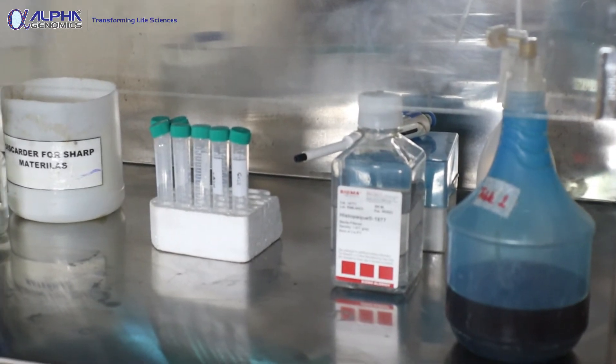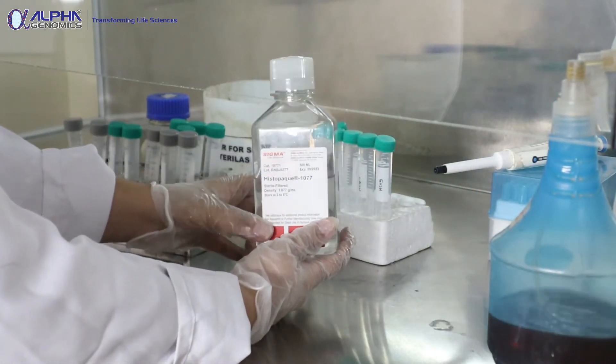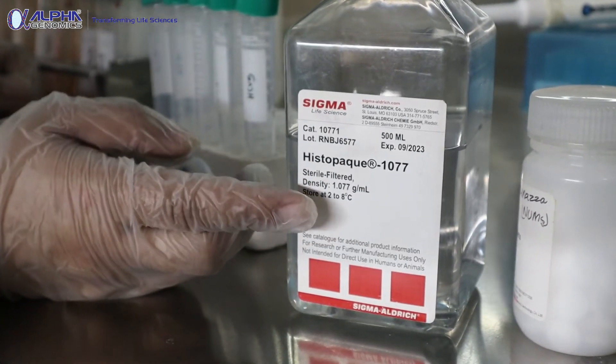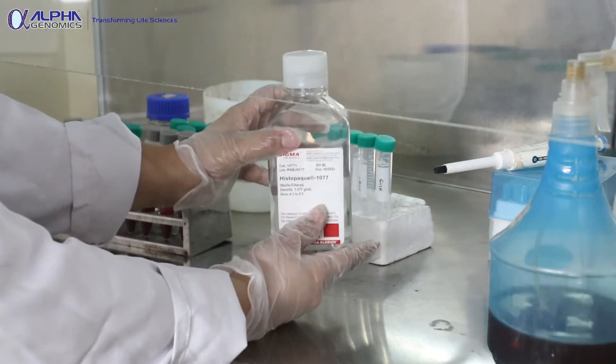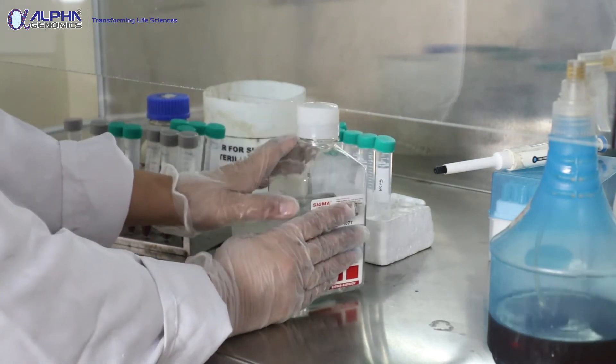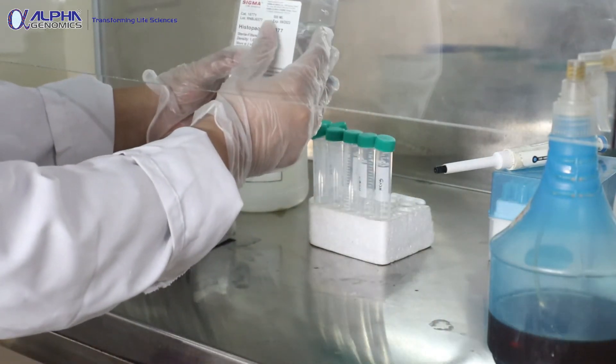Today we are going to separate cells from peripheral blood using the media called Histopaque, which is easily available in the market. The method being used is the density gradient method. This media creates a density gradient between the populations.